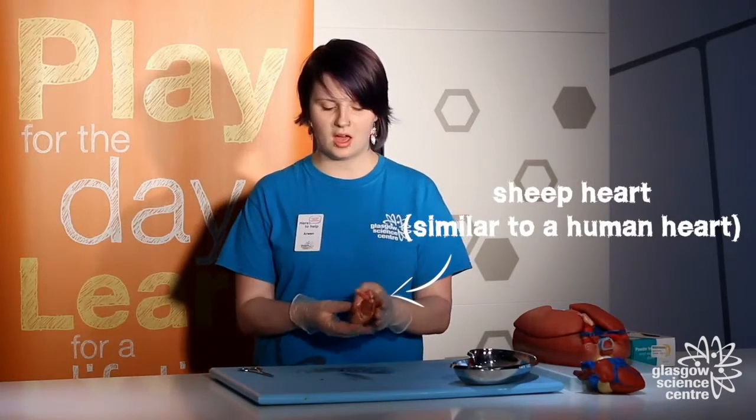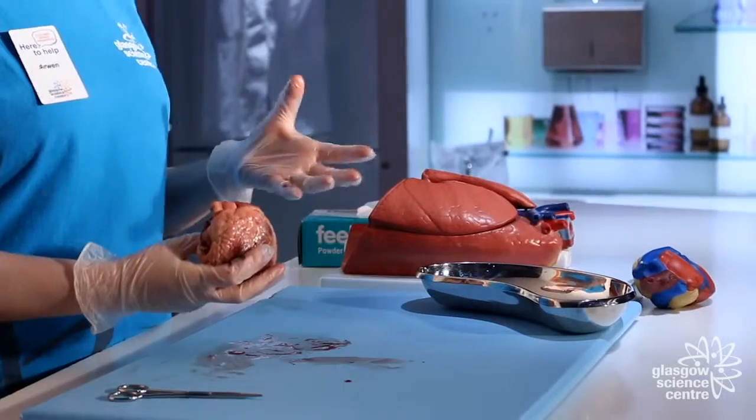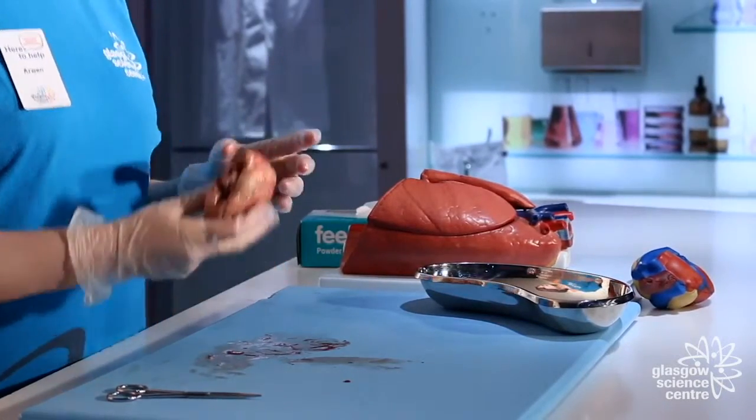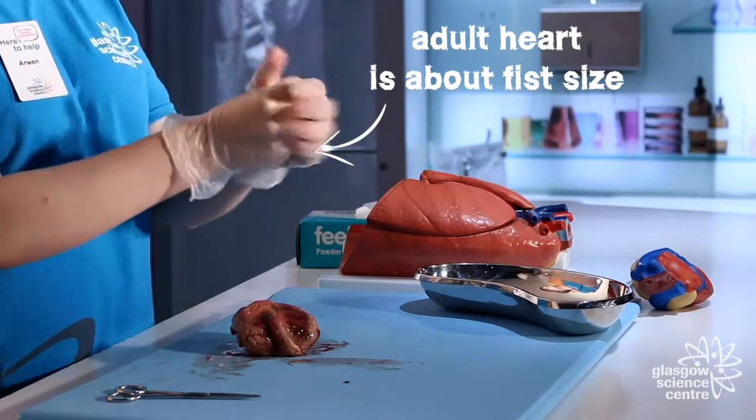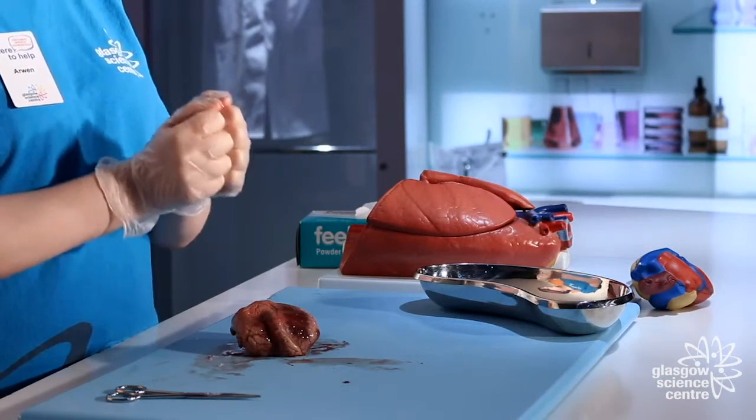Now you'll be glad to know this isn't a human heart. This heart comes from a sheep, so it is similar to our hearts as sheep are also mammals, but it's a lot smaller. The size of our heart will probably be about a fist, maybe a little bit over that depending on how sporty you are. For a child, take two fists and put them together — that will be about the size of your own heart.